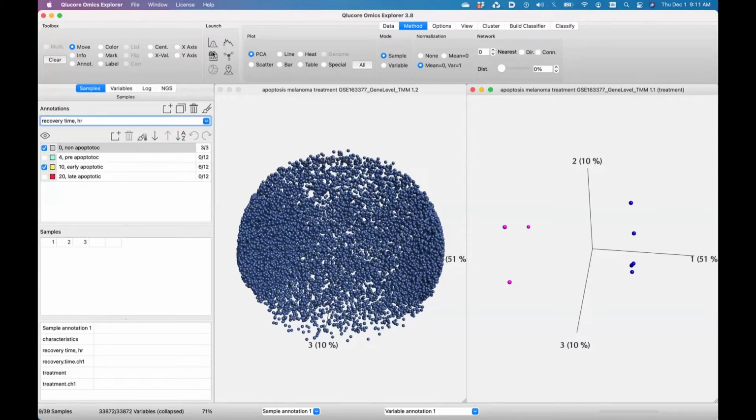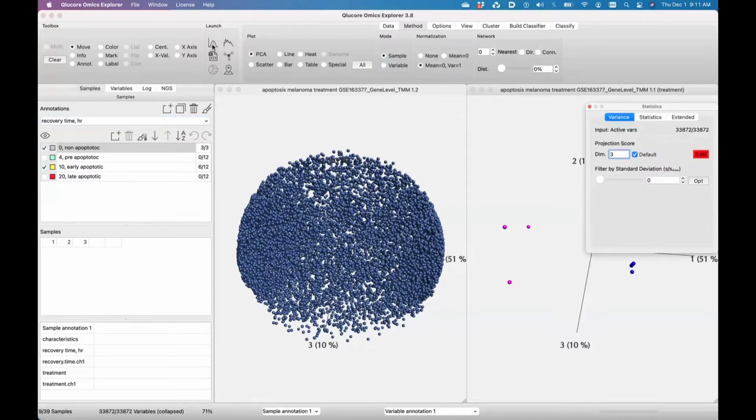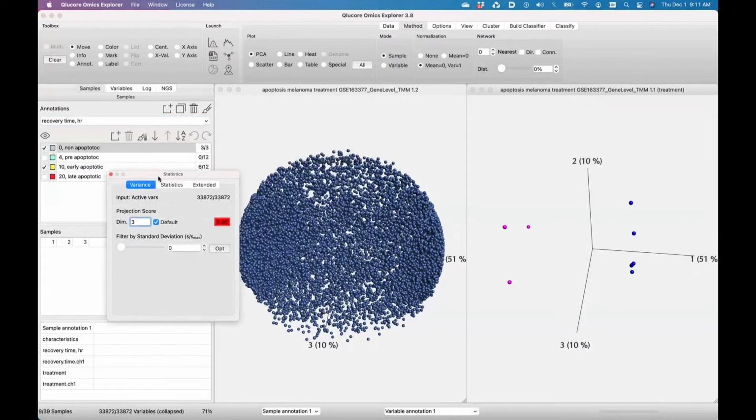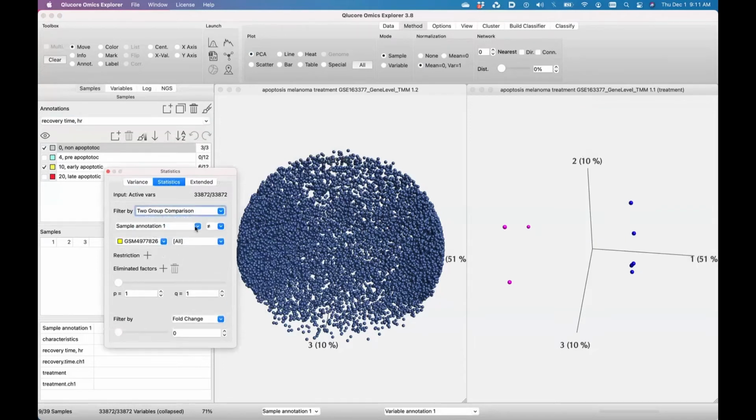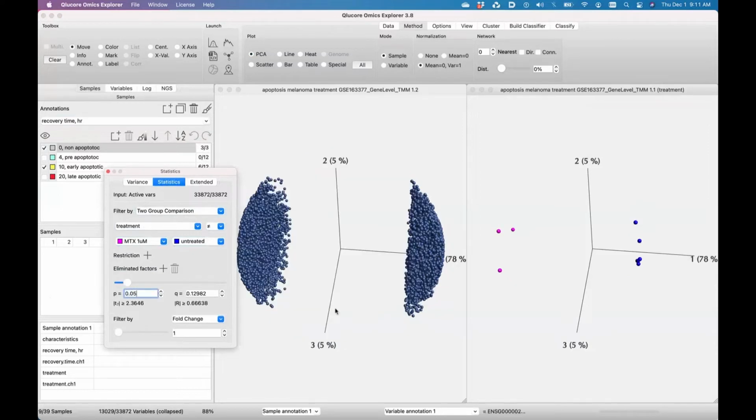But you can easily adjust all this in Qlucore, your inputs. So let's first set up quickly. I will just walk you through the typical workflow, how you would follow here. If we go to statistical analysis, I will run a two-group comparison on treatment, comparing MTX versus untreated control, two-way up and down. And I will start with p 0.05. So you see instant feedback in the software.